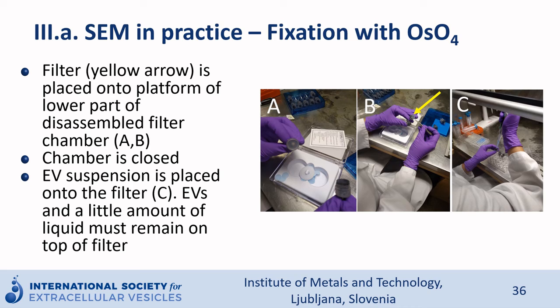However, to reach the sample, the electron beam must not be disturbed and therefore should travel in vacuum. Extracellular vesicles are formed in aqueous media, which must be removed. To conserve the shape of the vesicles and to improve the quality of the image, the samples are prepared with fixatives and stains.